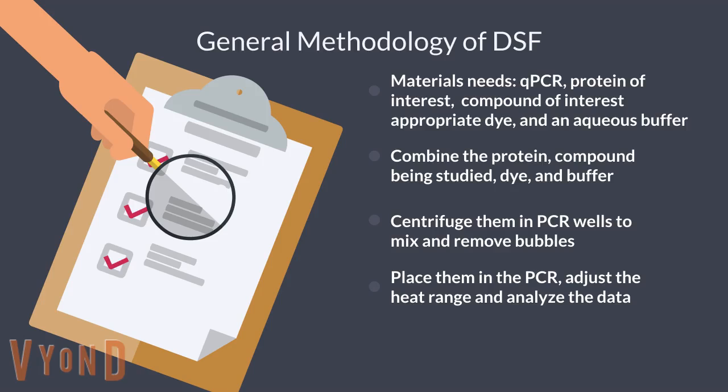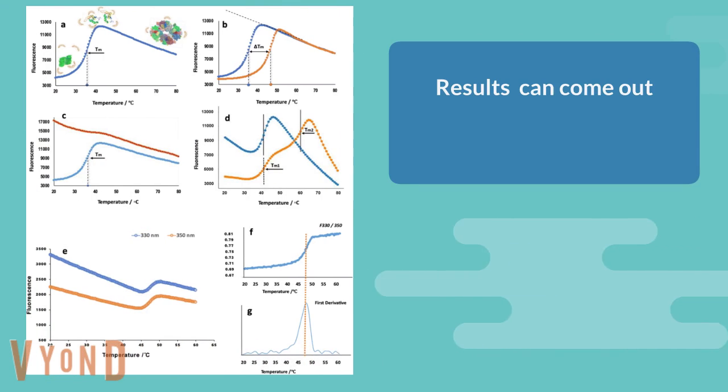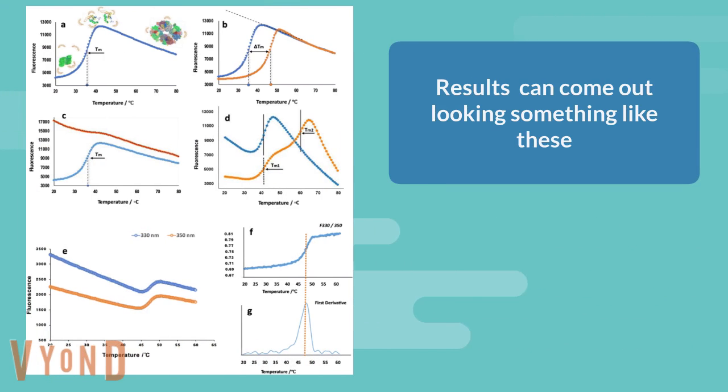And then you would place those wells into the PCR, adjust your heat range, because remember we are denaturing with heat, and then you would let the PCR run, and afterwards you would analyze that data and compare your different melting temperatures between the different concentrations of that compound of interest in relation to how it made your protein react. Once you've done all that, you can overlay the fluorescence peaks from the different concentrations and see the impact that the compound had on the thermal denaturation of the protein.